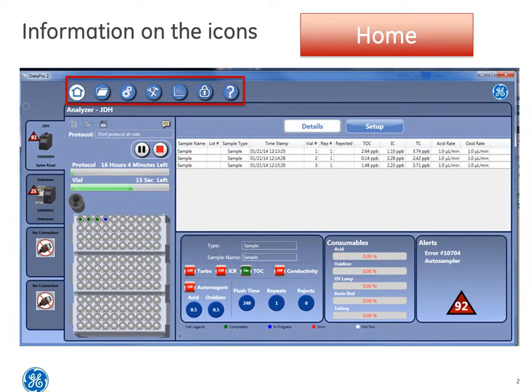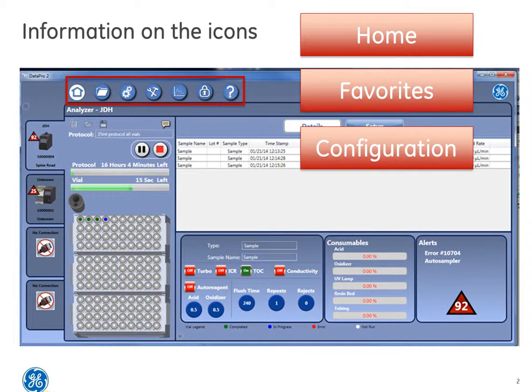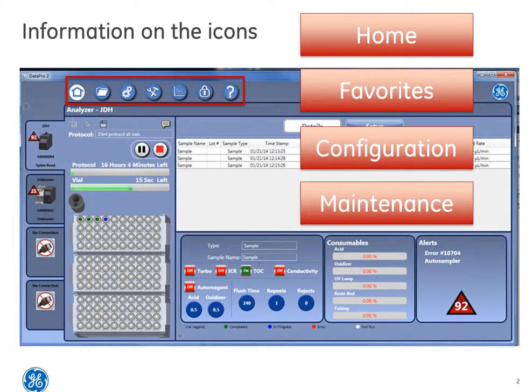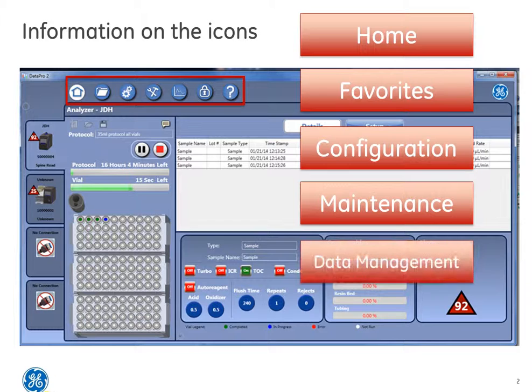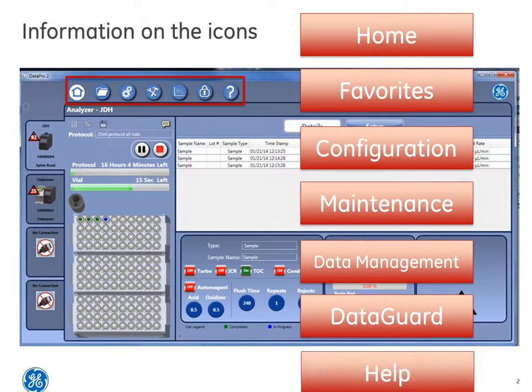These icons include a home screen, a favorites folder, configuration, the maintenance icon, data management, data guard, and finally the help icon.